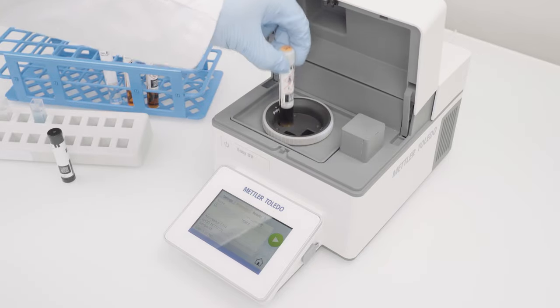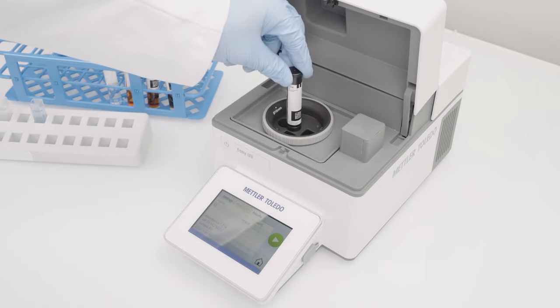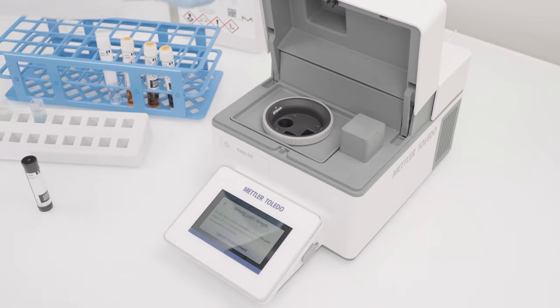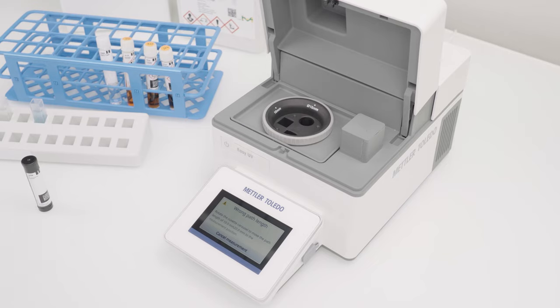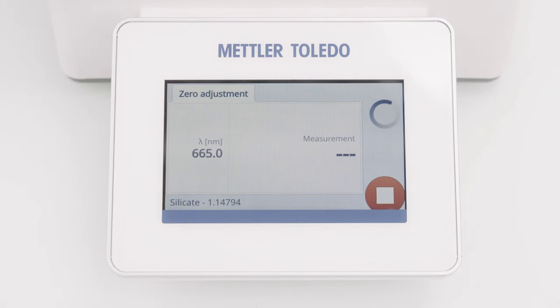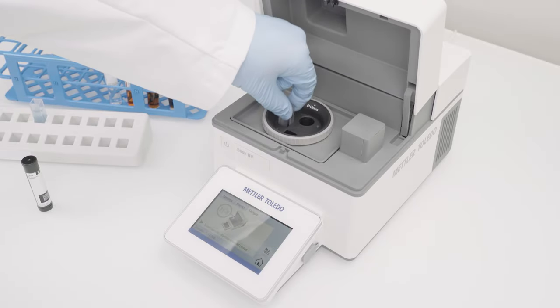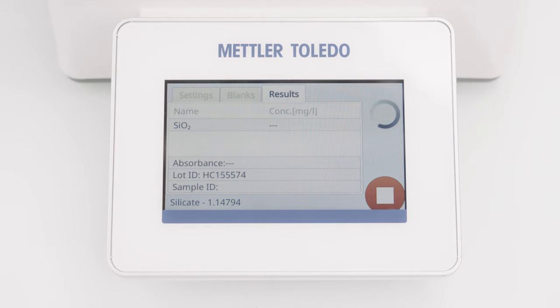For test kits with an auto selector, the barcode can easily be scanned. Afterwards, the instrument informs which path lengths are allowed for this test kit. The pop-up can be confirmed by moving the x-path holder into the correct position. The instrument asks me to insert the zero cell again. Close the lid, and the zero adjustment measurement starts automatically. Now I am asked to insert the sample. Let's open the lid again, replace the zero cell with the sample cuvette. I close the lid, and the measurement starts immediately.